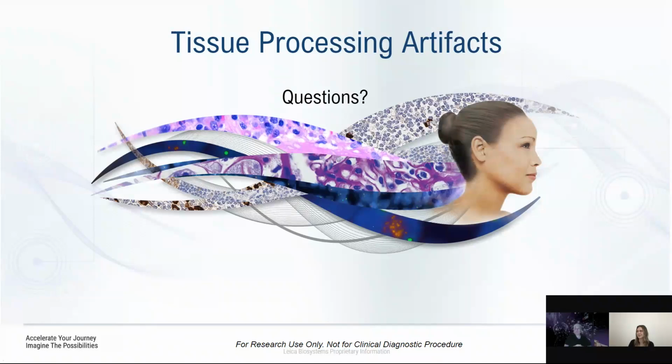And we've got time for a few more questions, and so many great questions coming in here. So we're going to continue. This next question I have for you asks, what is the time stability for prepared tissues?